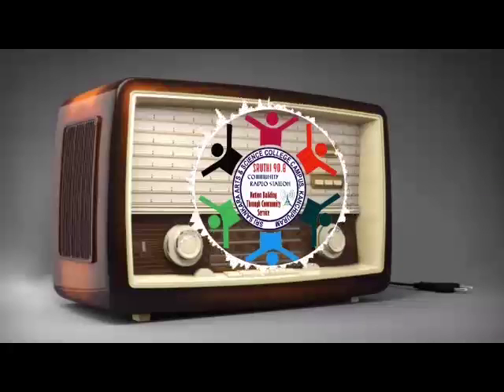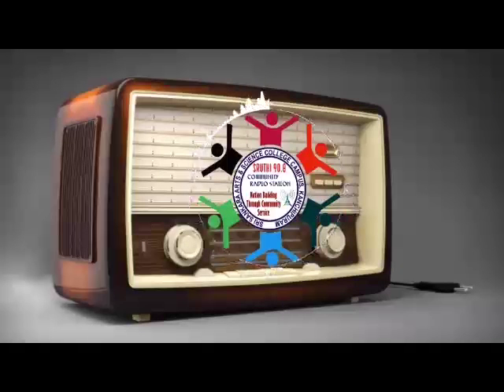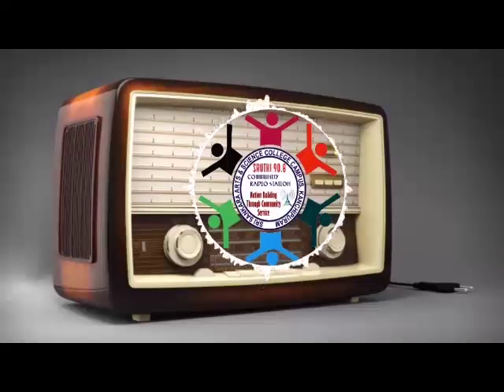The construction of a bioreactor requires steel or glass vessels, which give a place or support for the growth of microorganisms and their product. I already told you that in ancient days wooden or rock vessels were used for the fermentation process, but nowadays modern bioreactors are constructed with glass or steel material.